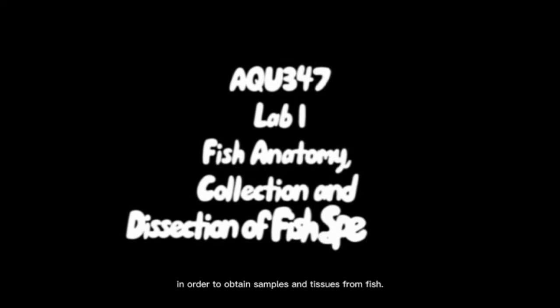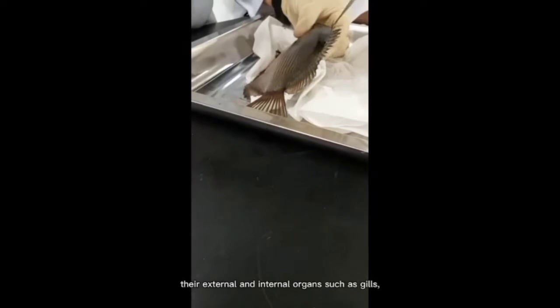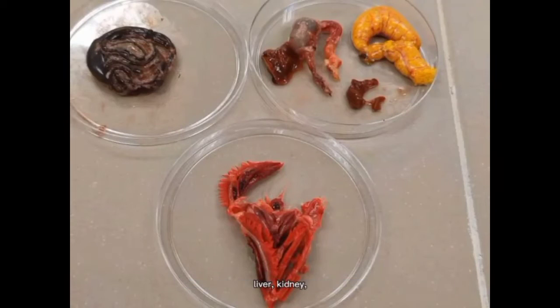From this Lab 1, we can conclude that there are several methods to obtain samples and tissue from fish. From dissecting the fish, we can see various techniques to observe their external and internal organs such as gill, liver, kidney, spleen, and many others.